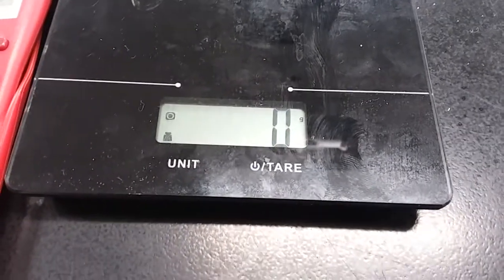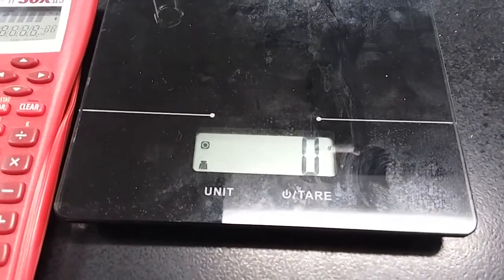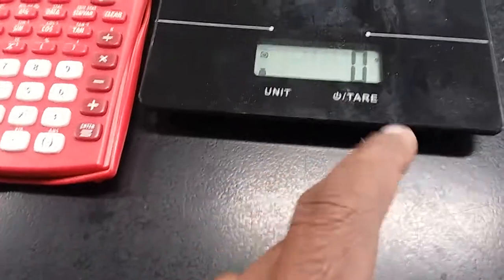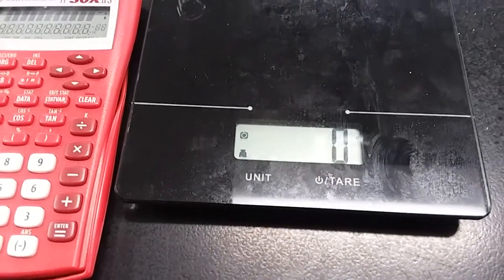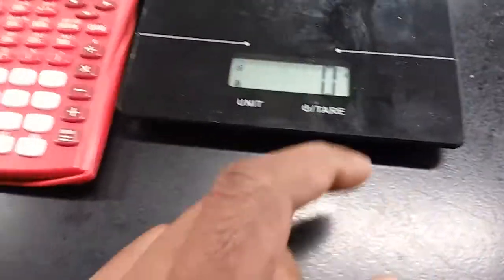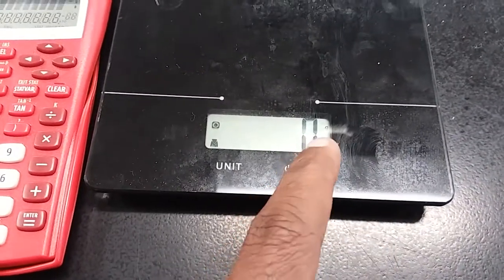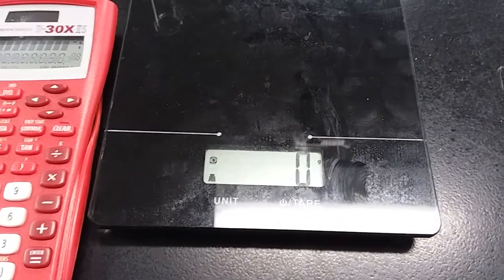Here's the scale. Notice how I can read the words on the scale. That means the scale is facing the correct way. Notice that the scale is at 0. So we are ready to weigh. If we had any number other than 0, we just hit tare. And now we're at 0 for sure.